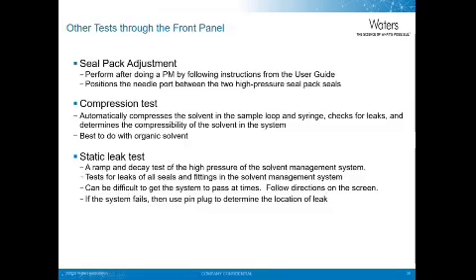Other frequently used tests through the front panel include a seal pack adjustment. This should be performed after doing a PM by following instructions from the user guide. This positions the needle port between two high-pressure seal pack seals.